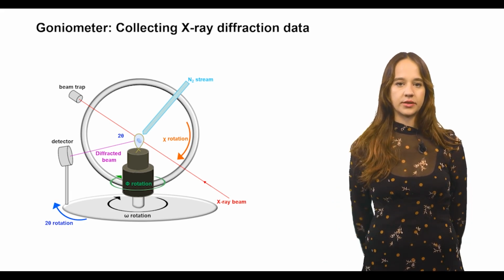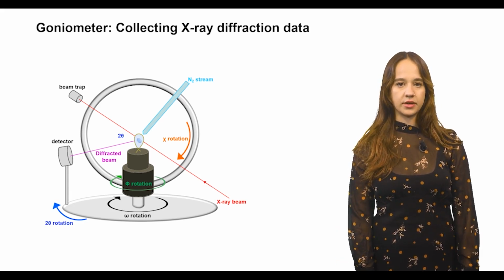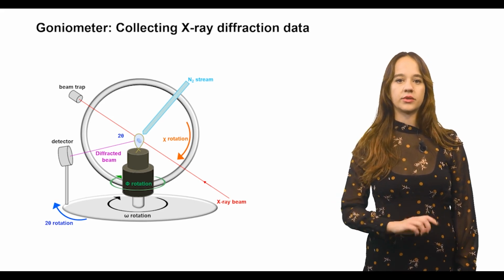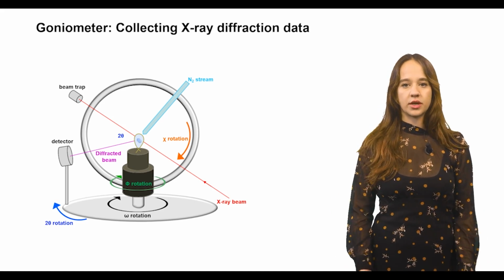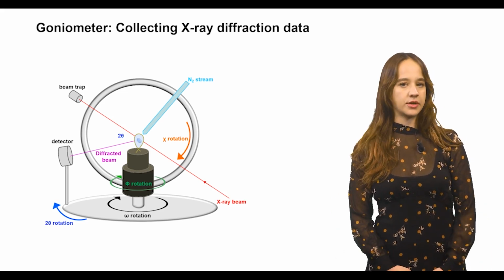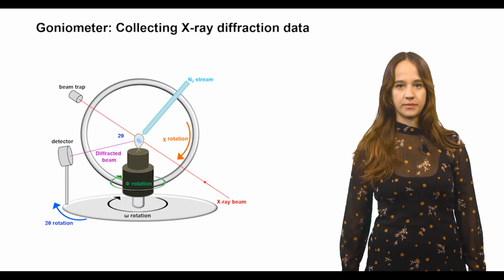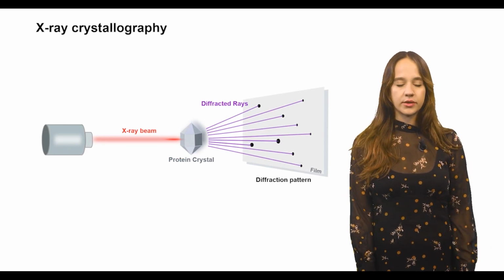The loop holding the crystallized sample is now positioned at the head of the goniometer. The goniometer holds the crystal in the beam of X-rays and rotates it to precise degrees. This allows the crystal to be struck by X-rays in all its different orientations, so as to collect enough data for diffraction. A liquid nitrogen stream is used as a cryostat.